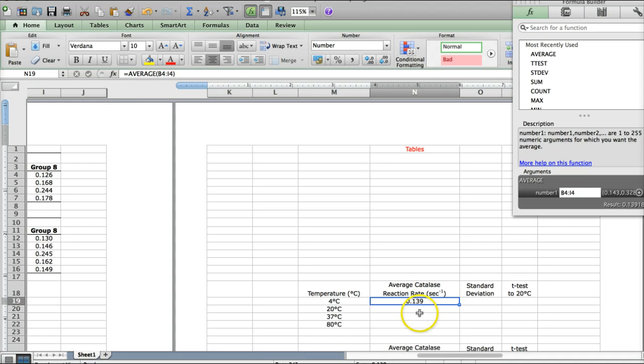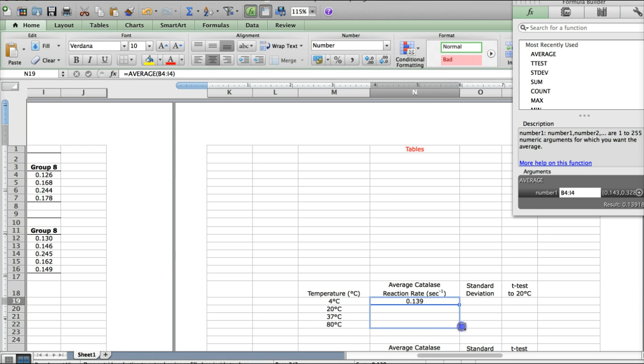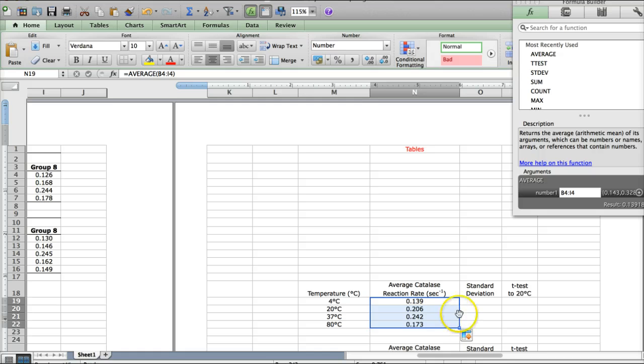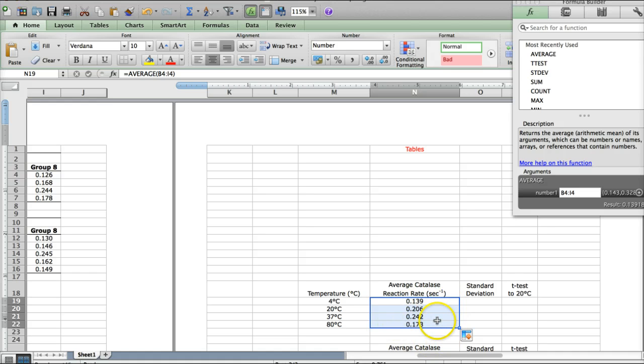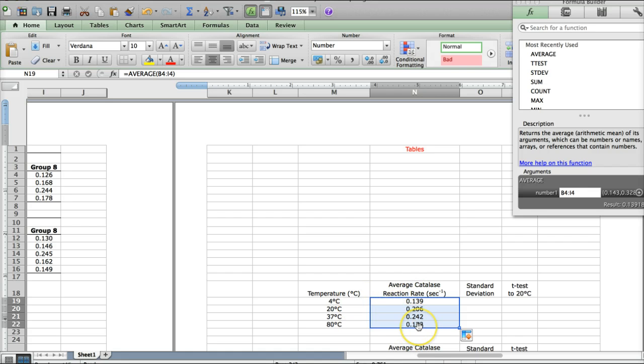You can do the same thing for all of the other temperatures, or if you want to speed things up, go to the bottom corner of the first box and your cursor will turn into this black plus sign. If you click, hold, and drag down, it will fill in all of the boxes below doing the same function, but for the data on the next row down. That's a quicker way to do all of the average calculations. Now we have average values for all of the various temperatures.